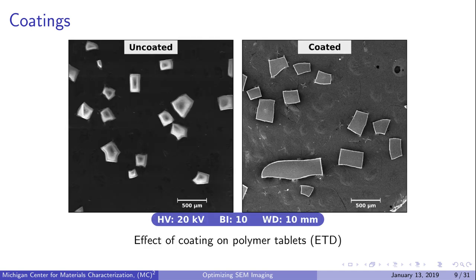Here's an example of uncoated insulating polymer tablets compared to the same material coated with gold. We can see charging on the uncoated polymer tablets. In general, charging degrades image quality.